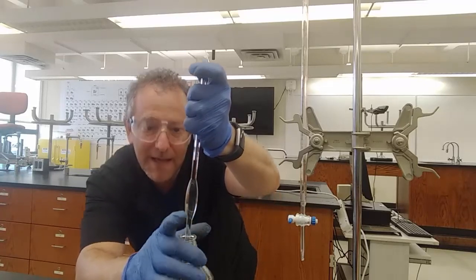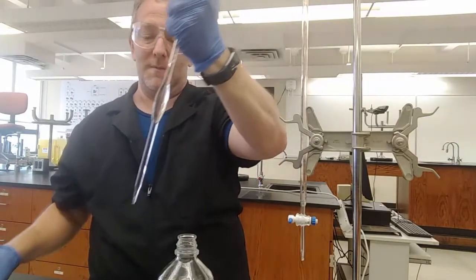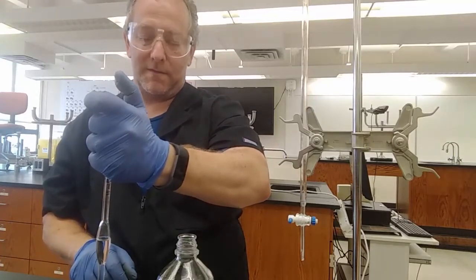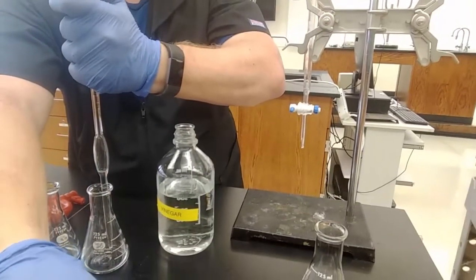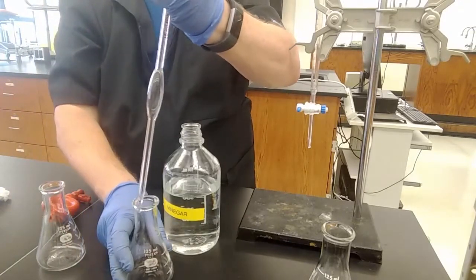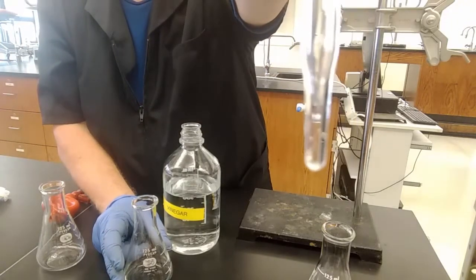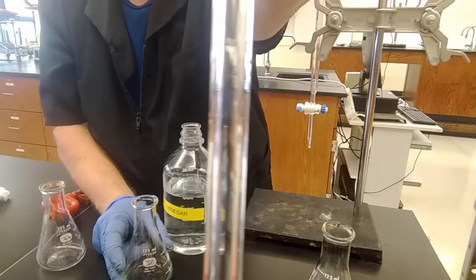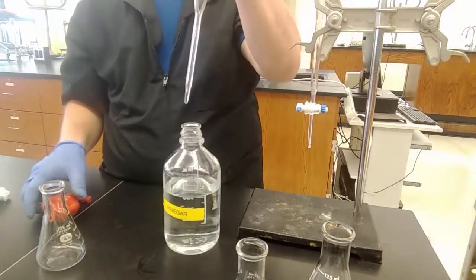Meniscus is exactly on the line, then I can put my finger over the top, maybe I'll wipe off the outside beforehand this time, and drain into the second Erlenmeyer flask. Drained on its own. I touch it to the side, get that last drop off the tip. But again, there is a little bit in the tip that is calibrated for and designed for. There are, again, drops inside the neck, not calibrated for, not supposed to happen. That's two of three.